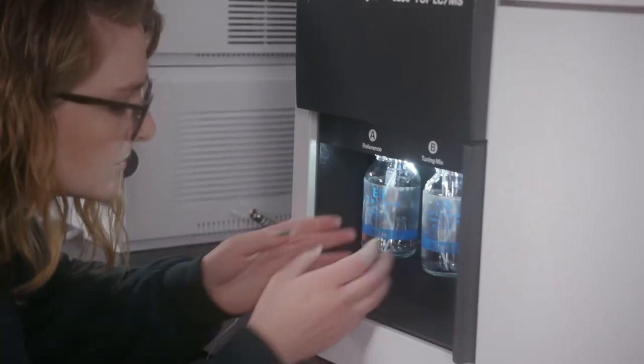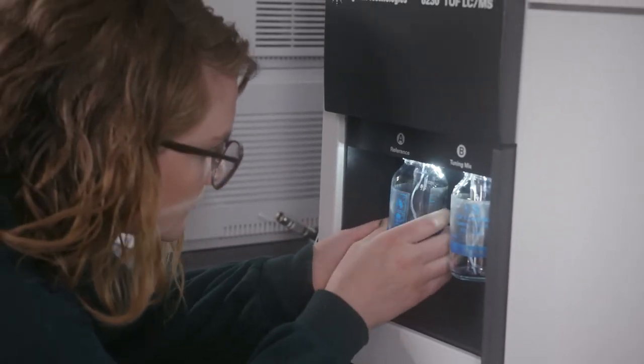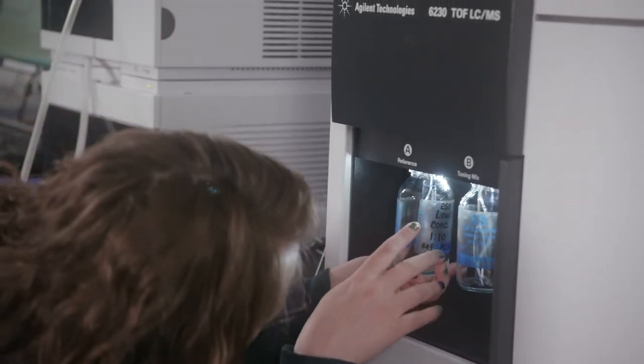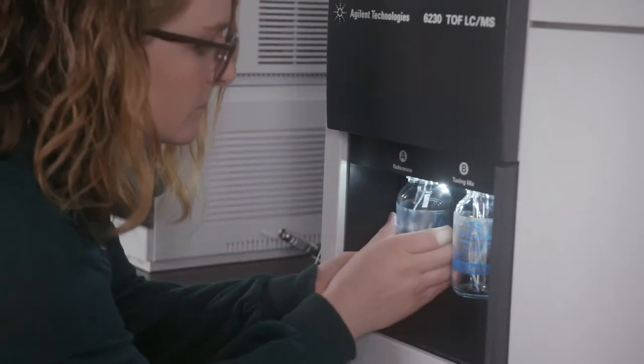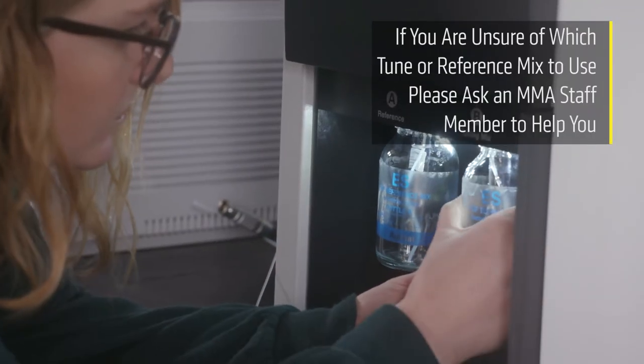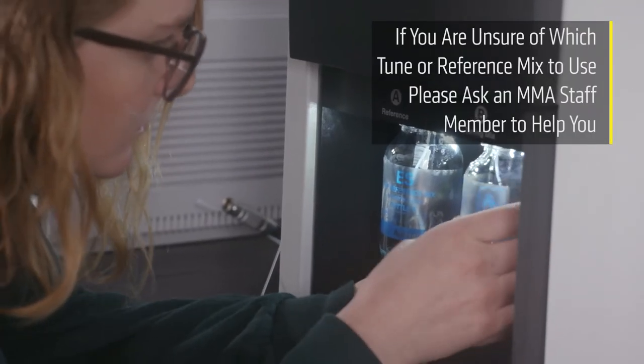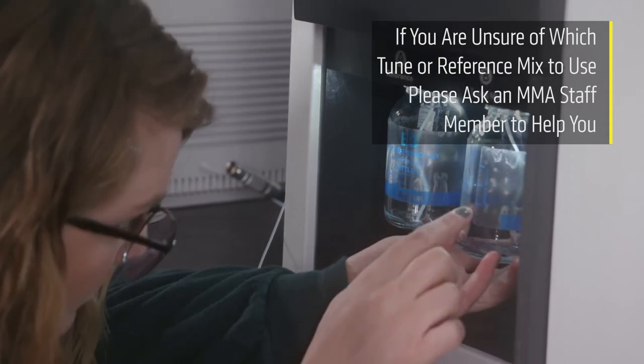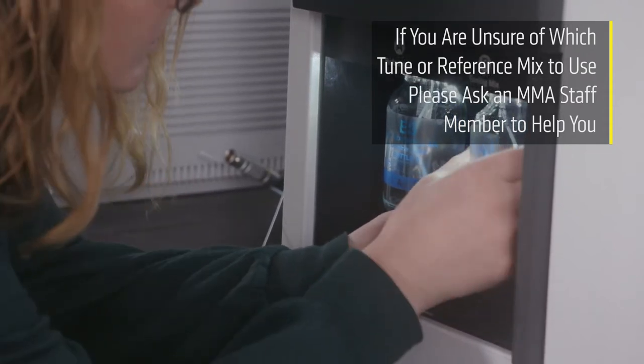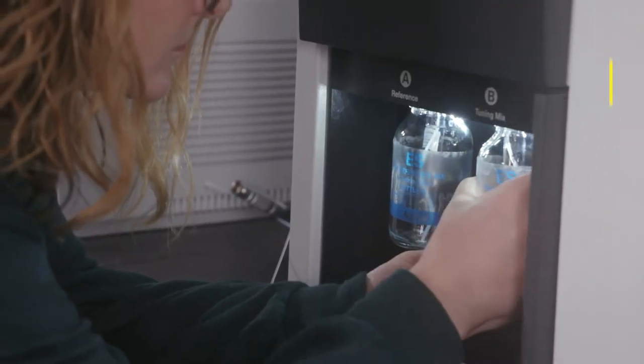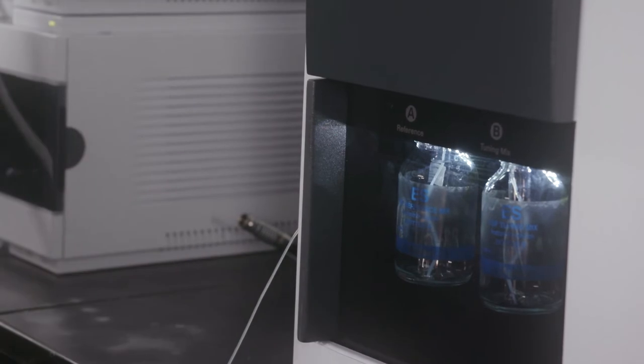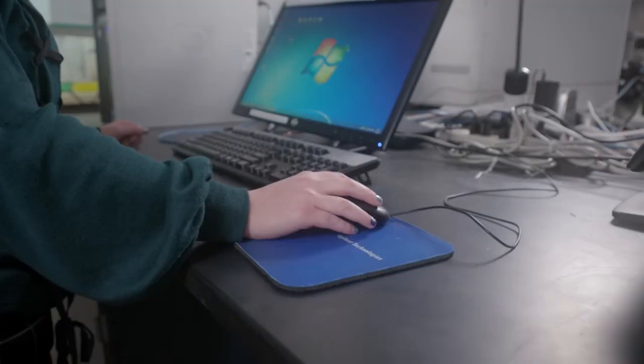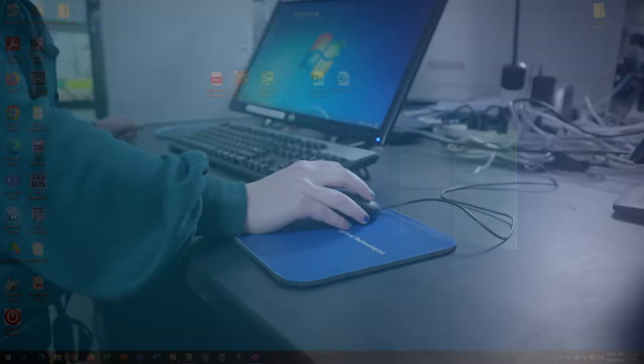Next, we will check levels of the reference and tune mixes. Calibrant bottle A is the reference mix and Calibrant bottle B is the tune mix. If either of these vials are empty or low, make sure to top off with the correct mix, which you will find stored in the smaller standards fridge. Now, we're ready to start using the instrument.